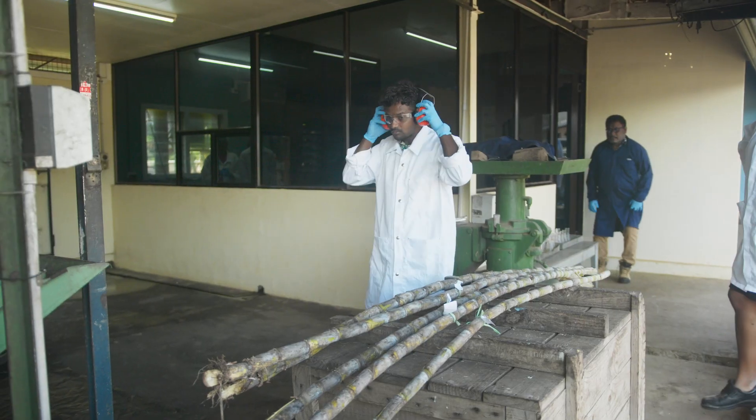These are the research trials being carried out by our research and scientific team at DRASA. We receive the cane samples from the various research trials and then they undergo a chemical process so that we are able to know the purity of the cane samples. When we receive the cane samples, we grind them.